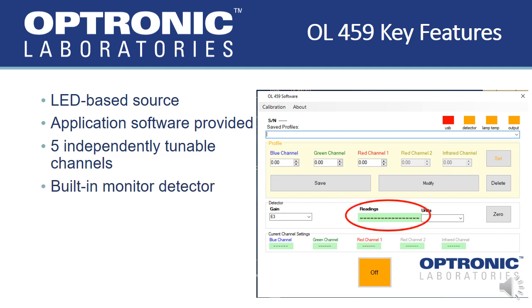The unit has a built-in heated monitoring photometer with the display being seen in real time. The gain of the photometer can be manually adjusted and the photometer reading can be zeroed when the unit and surrounding environment are stable to provide accurate luminance monitoring.